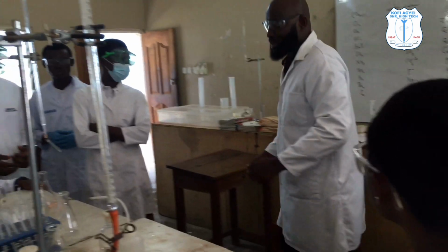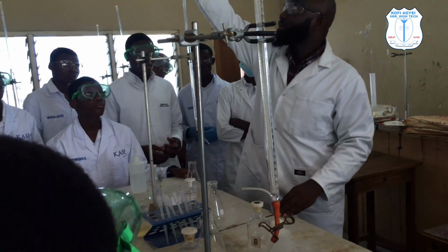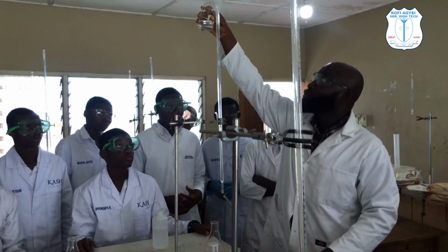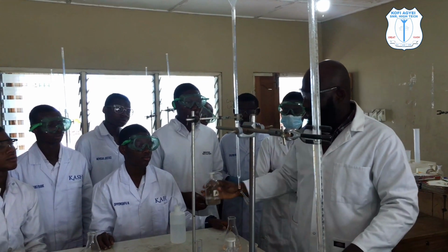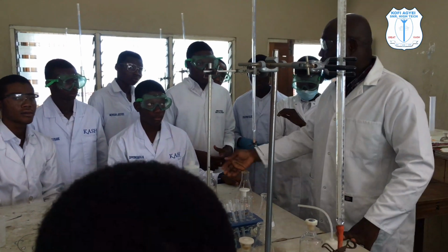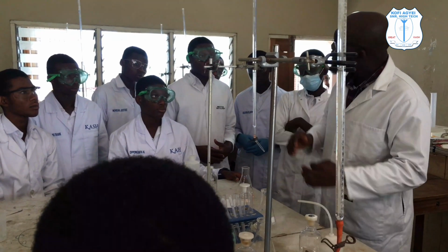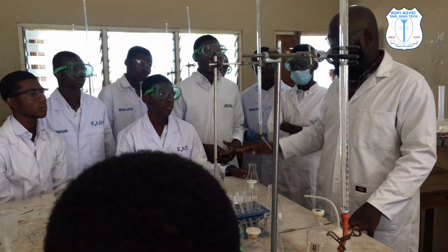Now I was expecting you to ask why you are supposed to pour the acid gently. This one is an acid. If you don't pour it gently, it's going to splash onto your face. Yes, it's a real acid, but we diluted it. With acid, whether you diluted it or not, it's still harmful. So you have to wear the goggles.